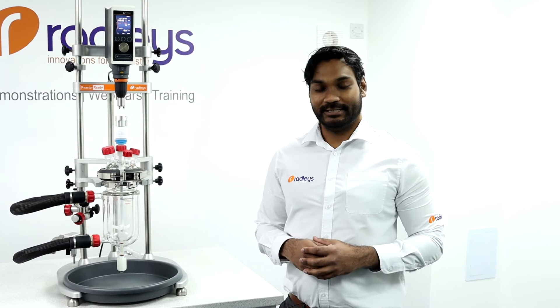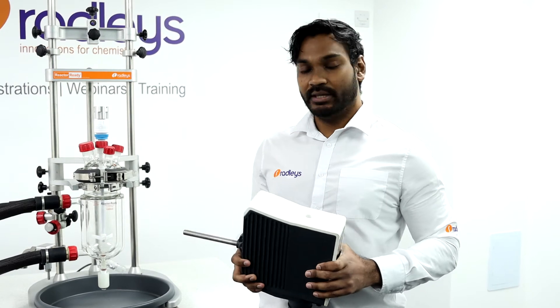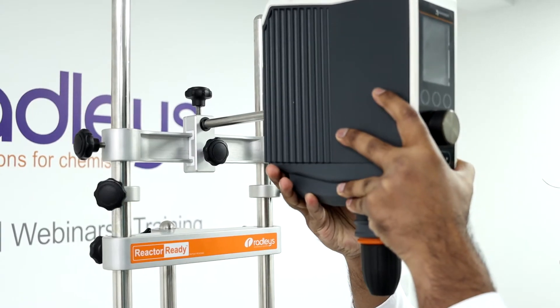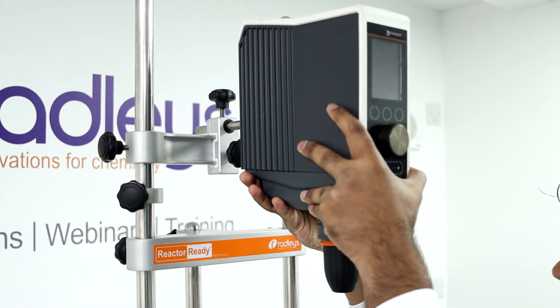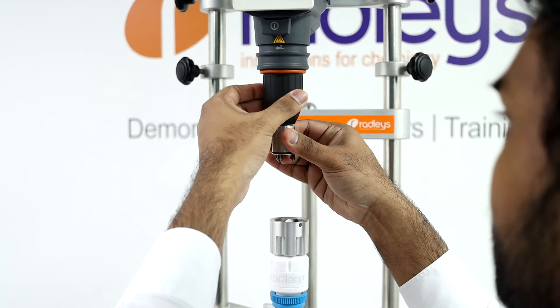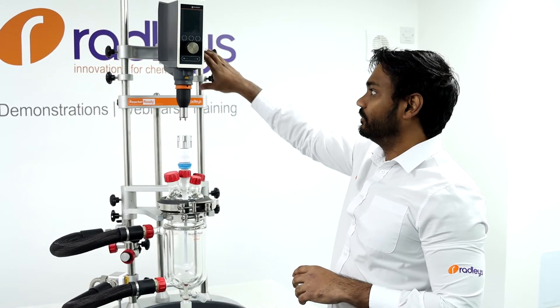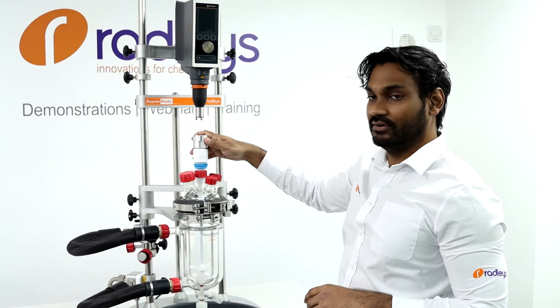Let me show you how to set it up. First, you want to insert the support rod of your overhead stirrer into the I-beam. With Reactor Ready you can use any brand of overhead stirrer — today we're using this Hydolph overhead stirrer. Next, you want to insert your drop-in coupling into the chuck of the overhead stirrer and secure it. You can then use the I-beam to line up your overhead stirrer with the stirrer guide.